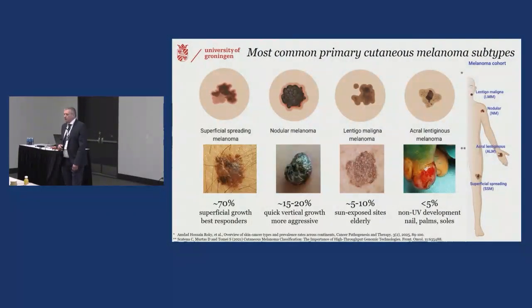Lund obtained the Covaris R230 acoustic focused sample preparation, and we performed a pilot, and I will present the results of this pilot here.